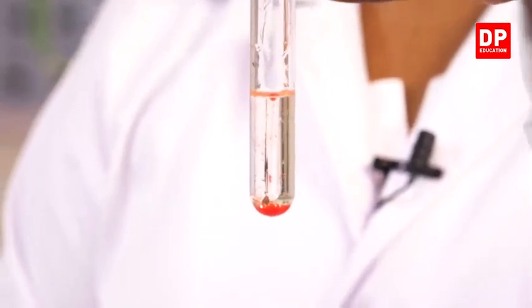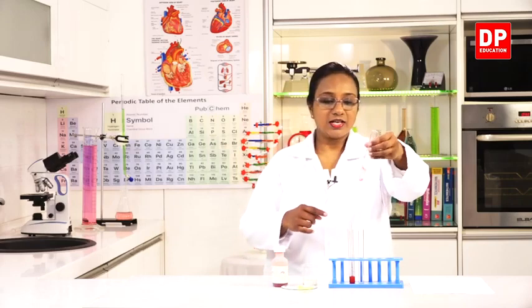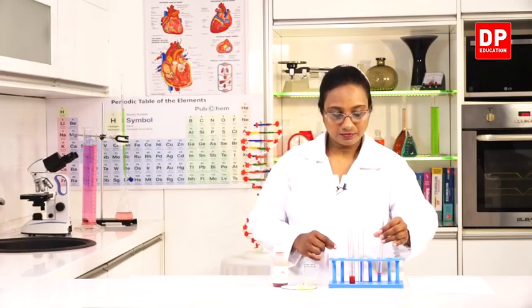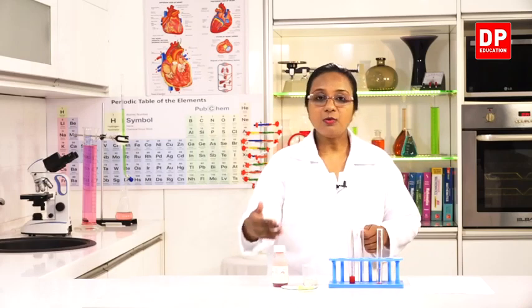So this is the observation for the presence of lipid in food samples. When you add Sudan 3 reagent, there should be an appearance of red fat globules as you see here. The globules are going down from the top. So that is a very simple activity to test for the presence of lipid in oil as a lipid substance. Now we will see the test for solid lipids, that is fats.